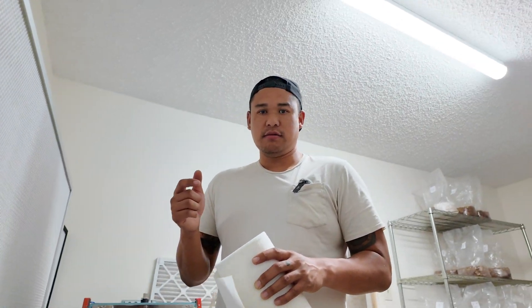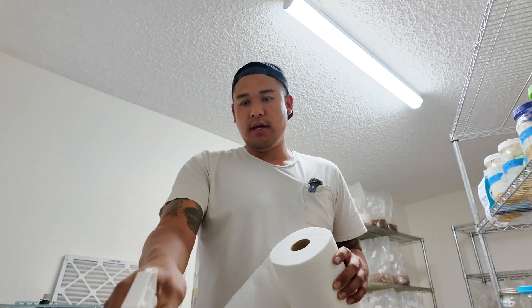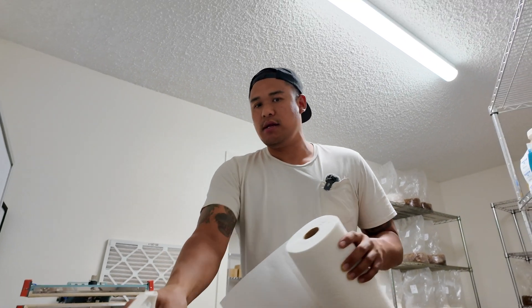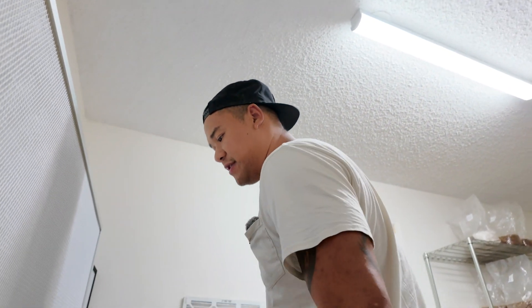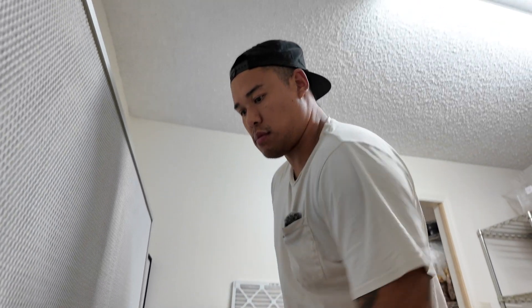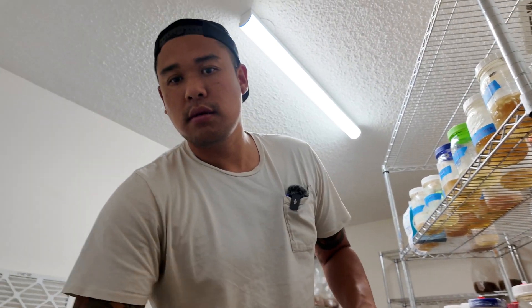The first thing we're always going to do is clean down our work surfaces. We take 70% isopropyl and spray down everything — all of our stainless steel tables — and give it a nice wipe with a paper towel to get the working surface clean. Now that we have a clean surface area, we can start.